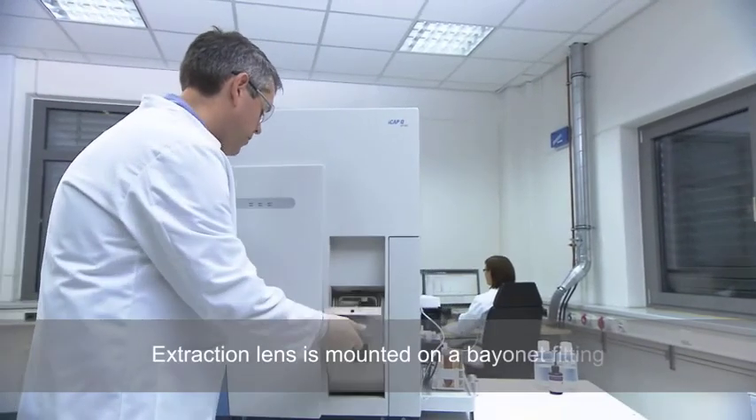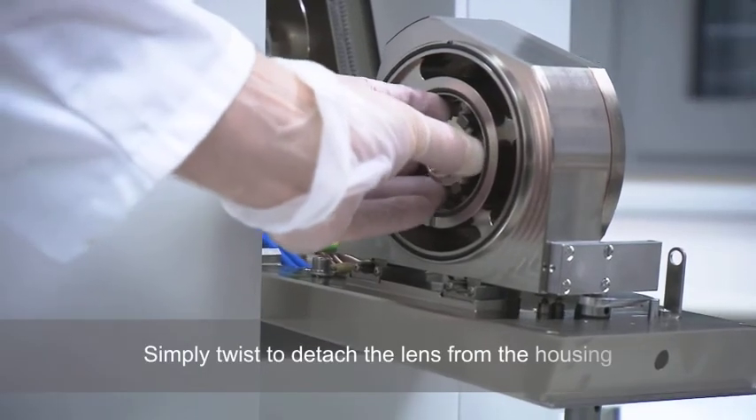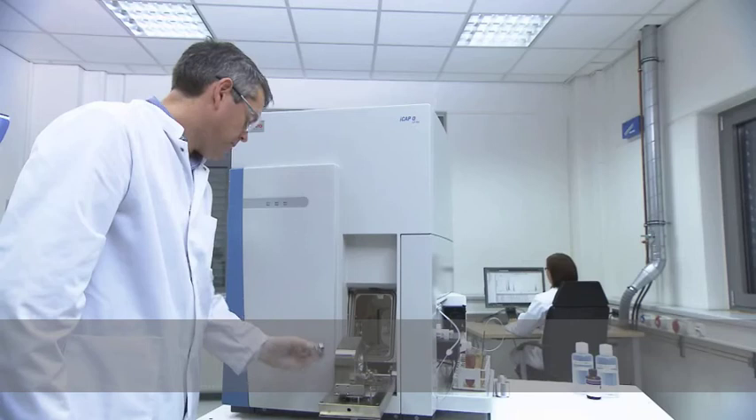For simplicity, the extraction lens is mounted on a bayonet fitting. A simple twist is all that's needed to detach the lens from the housing for examination, cleaning or replacement.